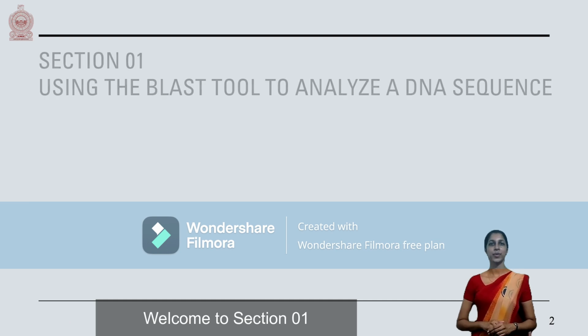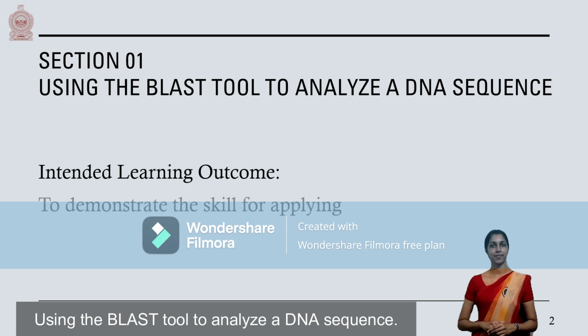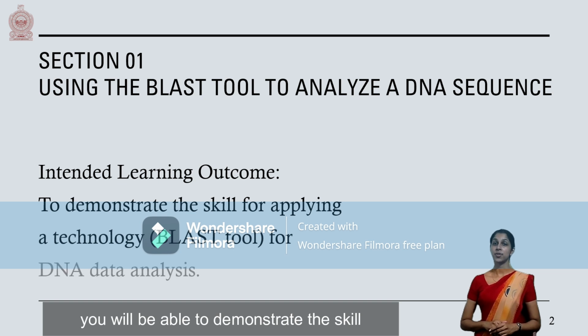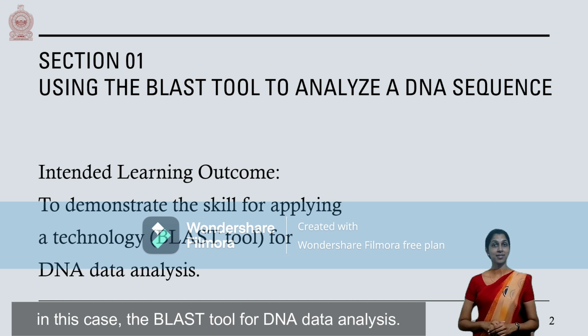Welcome to Section 1, Using the BLAST tool to analyze a DNA sequence. By the end of this section, you will be able to demonstrate the skill for applying a technology, in this case the BLAST tool, for DNA data analysis.